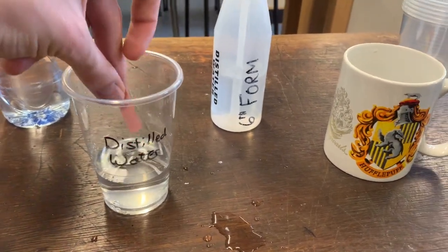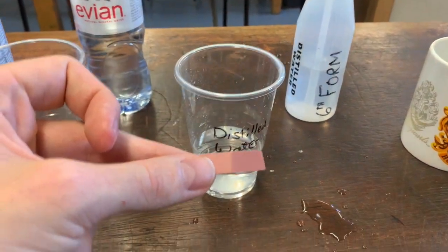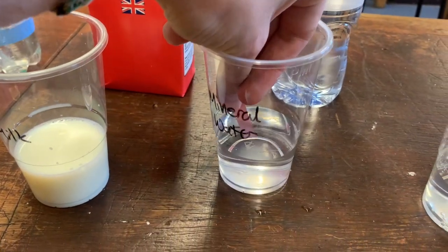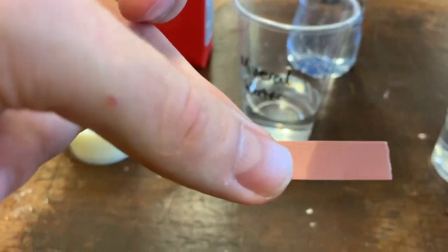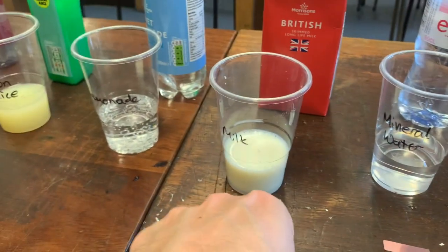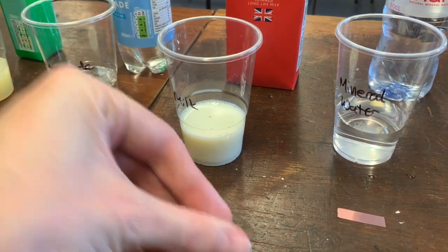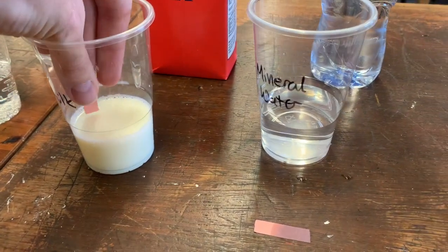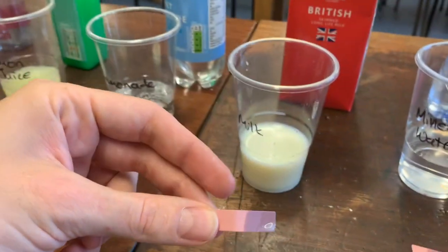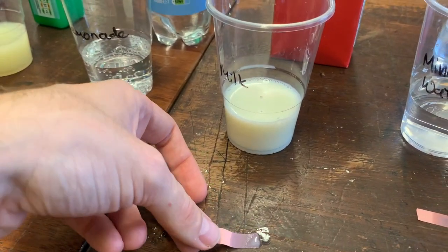First, we're going to test the distilled water, and we can see that we've got no change. Then the mineral water — maybe that's going a little bit blue. We've got our milk now. Again, looks like it's going a little bit blue.